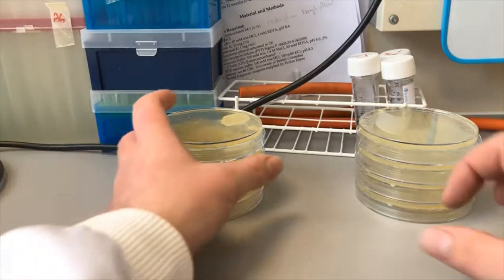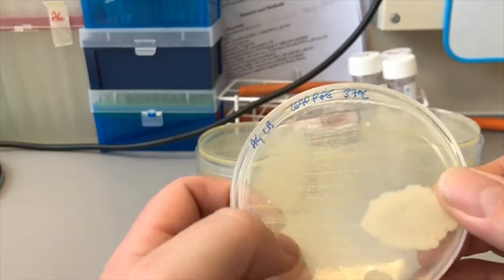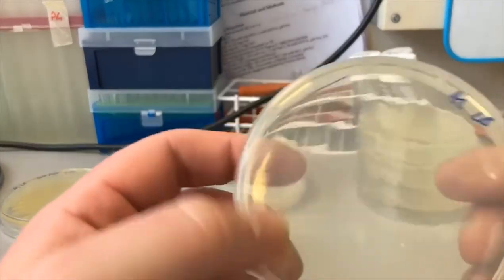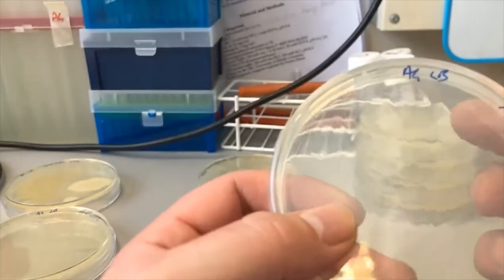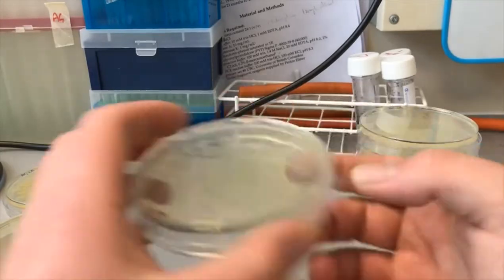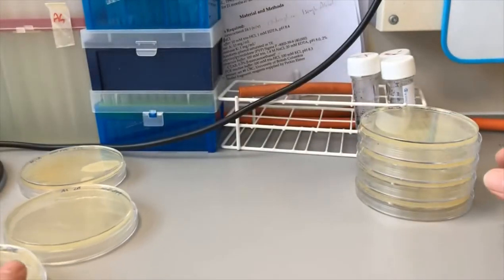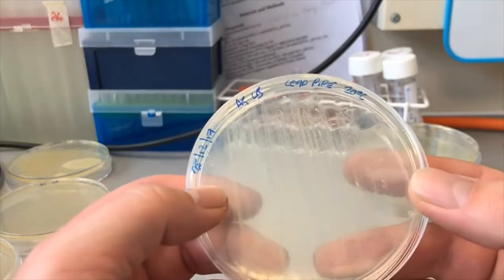Okay, so we're 48 hours later. I've come back to have a look at the plates. This is the lead pipe — as you can see, this has really started to grow. We've got an orangey-looking bacteria all over here. This has grown quite a bit. The bell, for example, has only one colony. The mouthpiece is starting to grow some as well — there are quite a few colonies on there now. The main tuning slide has definitely got some growth too. So you can imagine: this is from a relatively clean trumpet, but we're getting an awful lot of growth. The environmental samples kept at room temperature have also started to grow — this is the stuff living inside your instrument.